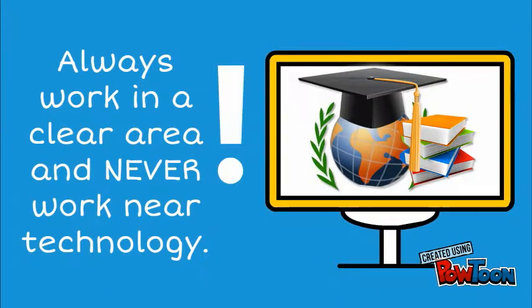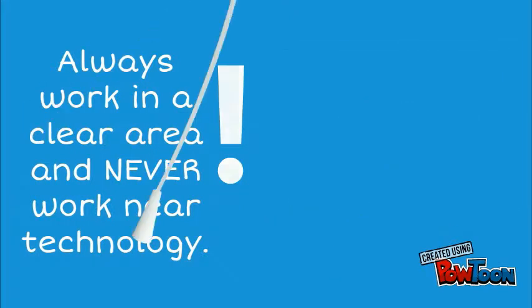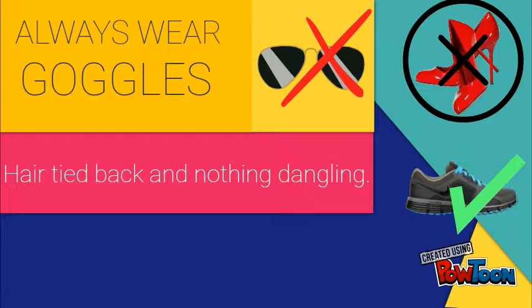Always make sure you're working in an uncluttered area so that you don't damage yours or anyone else's belongings, and never work near technology, because in case you didn't know, that stuff is very expensive. Make sure you're always wearing goggles, and no, glasses do not count. Also, your hair should be tied back and you should have no dangling clothes or jewelry. Also, your shoes should always be closed-toed.